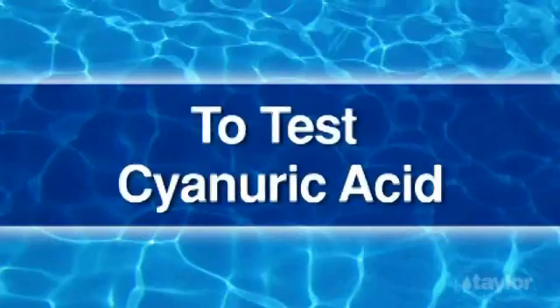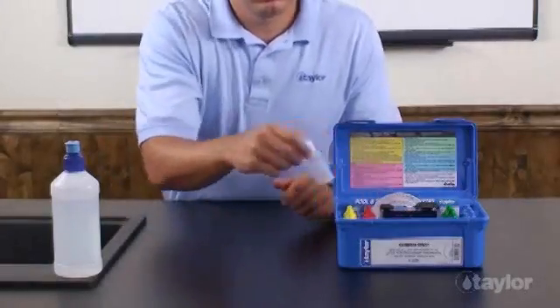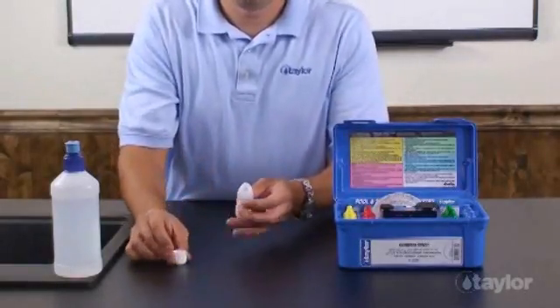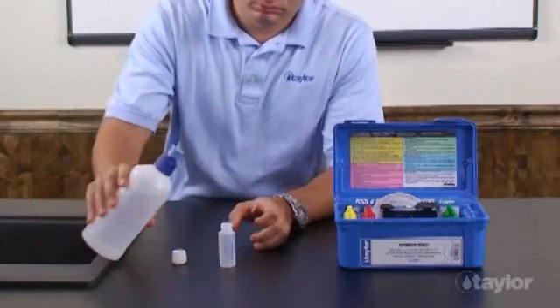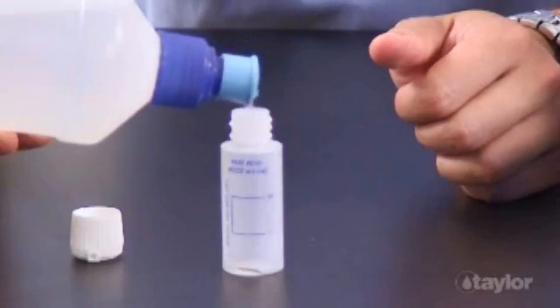To test cyanuric acid, rinse and fill the CYA dispensing bottle, number 9191, to the 7ml mark with the water to be tested.